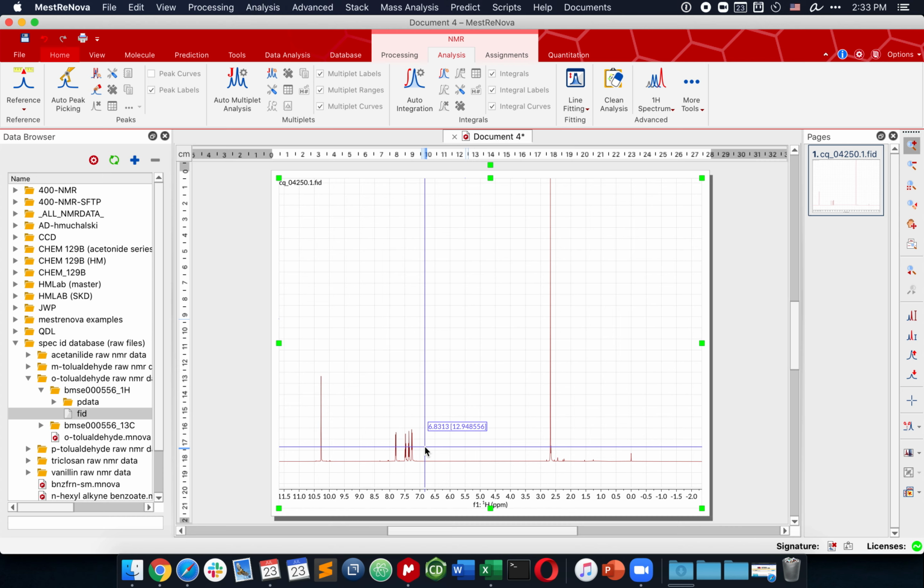On how to do basic processing on NMR data using MestReNova. The buttons and functions that we will be using are in the NMR group of functions, and they are activated upon opening of a data set.